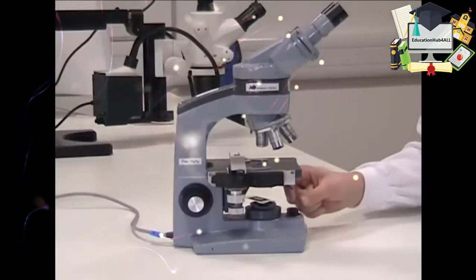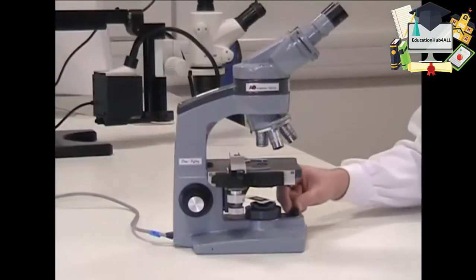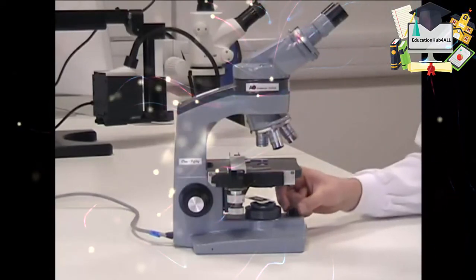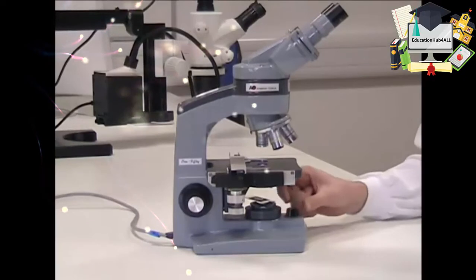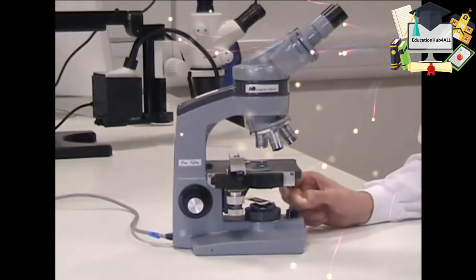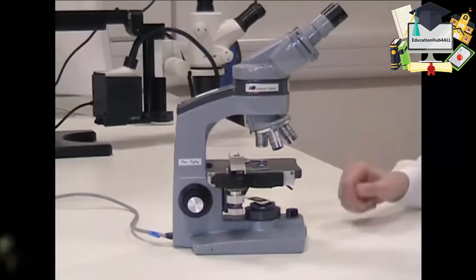The first thing you need to do is turn on the light. This is done with the control at the bottom here. This turns the light on and also, by turning it round, increases the intensity of the light. Avoid turning it right up to its fullest brightness to start off with because it might be very bright when you first look down the eyepieces.